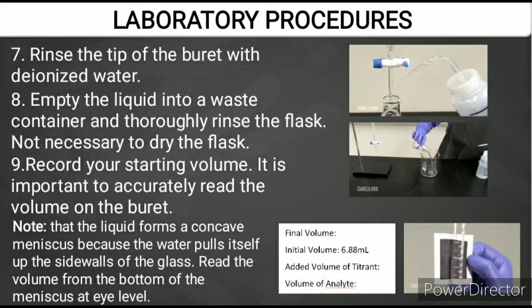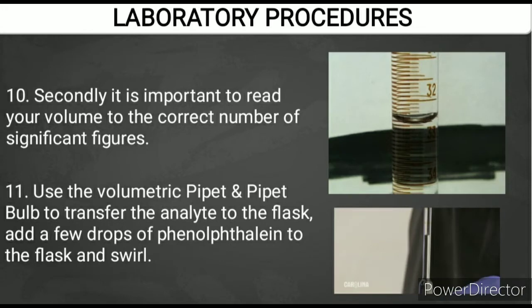Read the volume from the bottom of the meniscus. Secondly, it is important to read your volume to the correct number of significant figures.